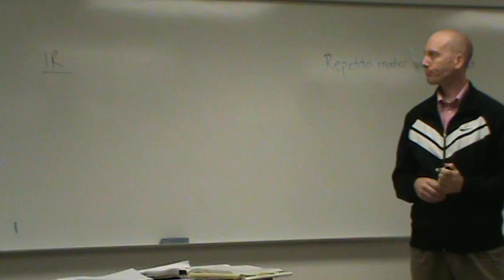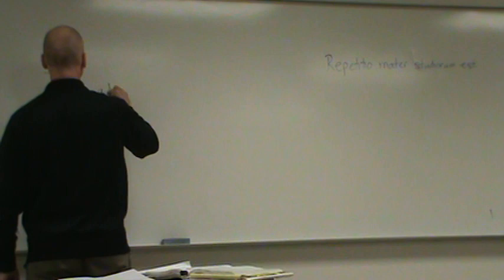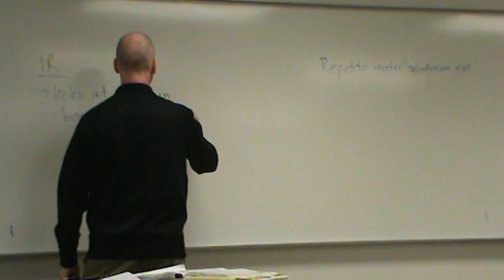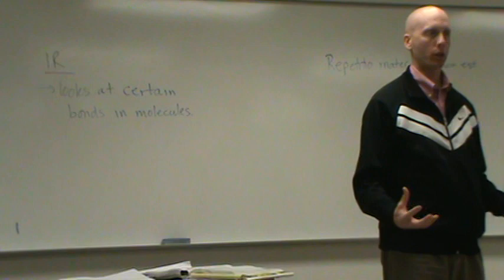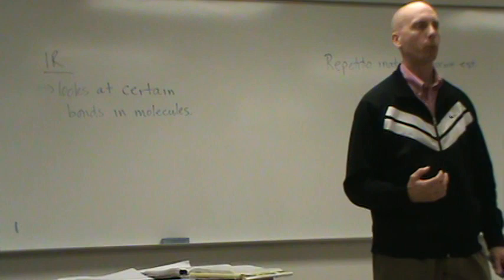Okay, what does IR spectroscopy look at? It looks at certain bonds in molecules. It looks at certain bonds. Okay? Write it down. IR is not going to look at the whole molecule. It's only going to look at chunks of the molecule. And those chunks are what? The bonds. Some of those specific bonds that we can identify.